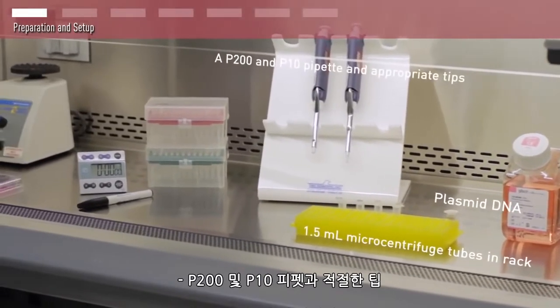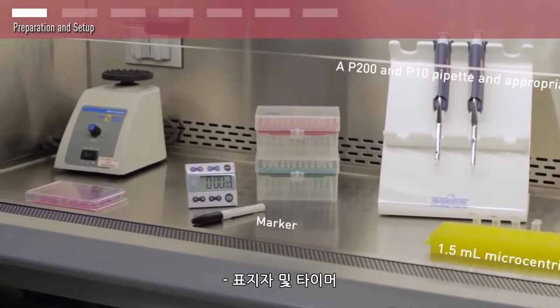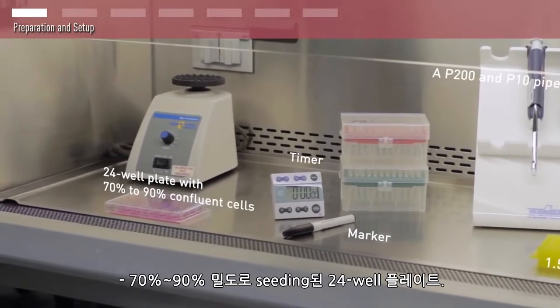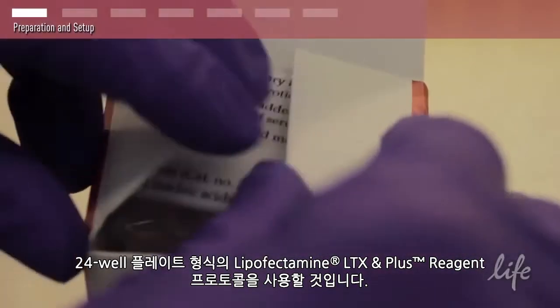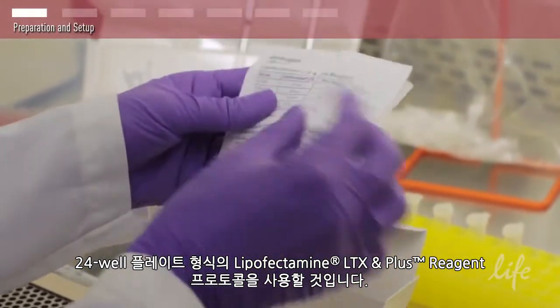You will also need a P200 and P10 pipette with appropriate tips, a marker and a timer, and a 24-well plate with 70% to 90% confluent cells. We will be following the 24-well plate format of the Lipofectamine LTX Plus reagent protocol.